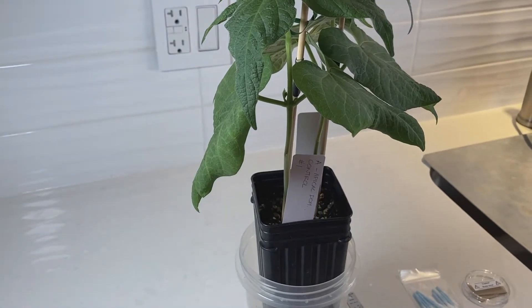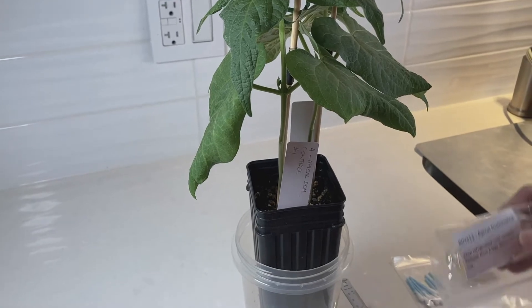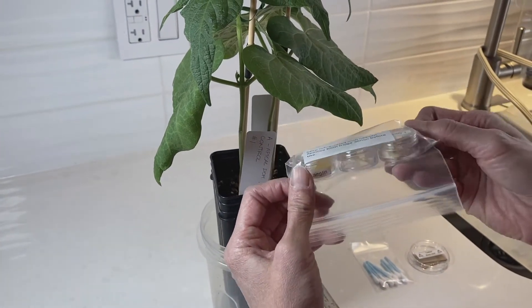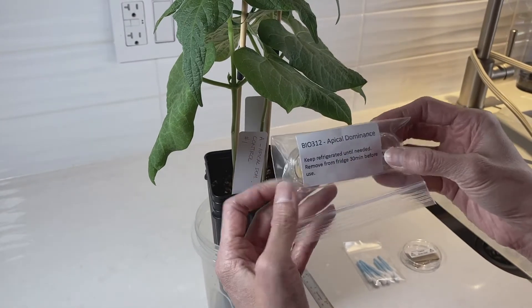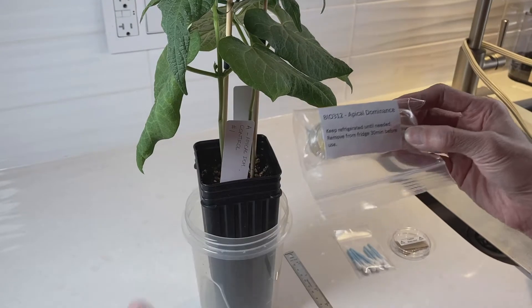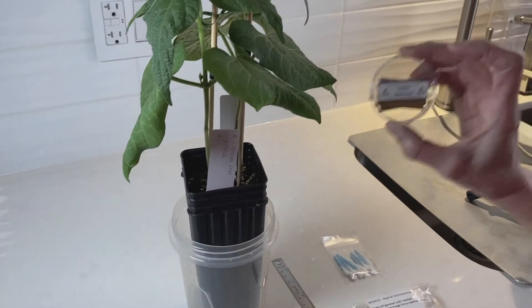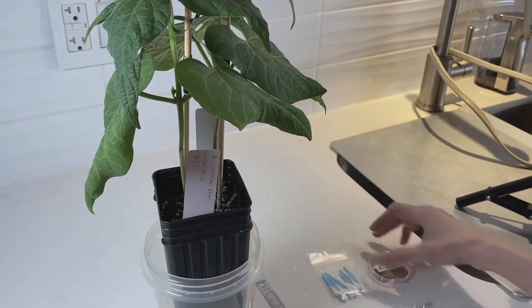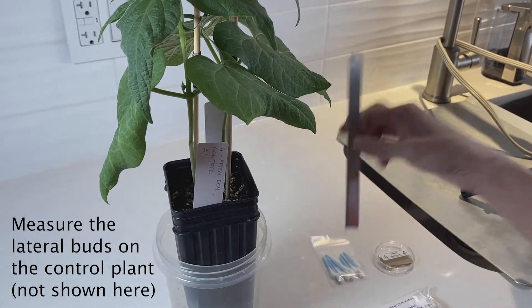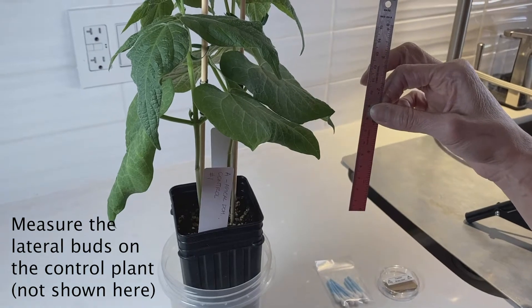For this experiment you will need your apical dominance package with the lanolin and hormones. Take this out of the fridge about 30 minutes before you need it — I've already taken mine out. You'll need your razor blades, your Q-tips, and you will have to supply a ruler to measure the lateral buds.